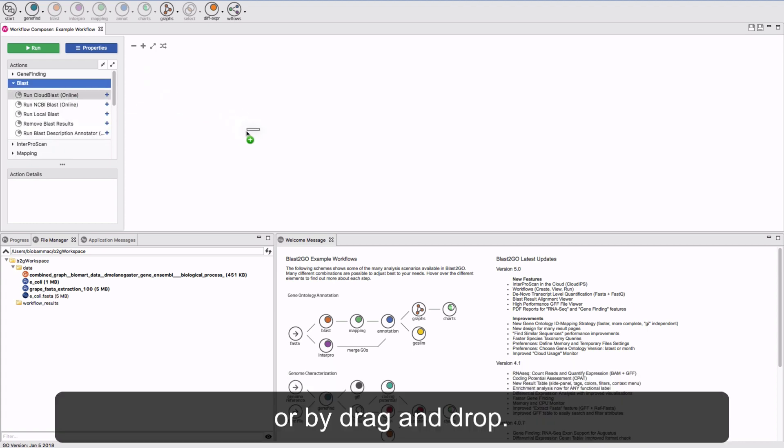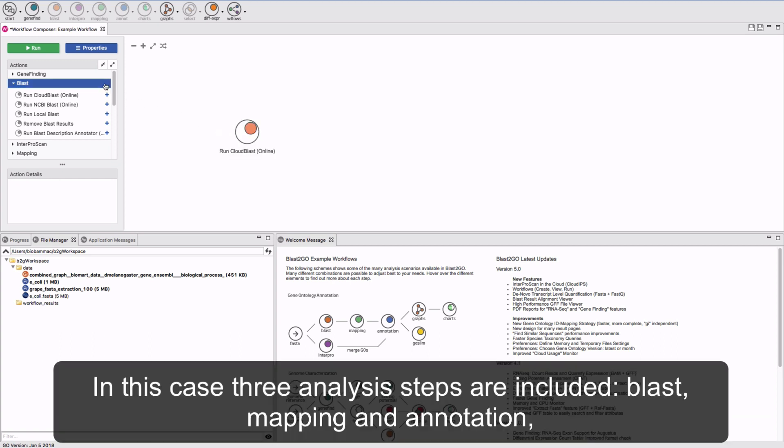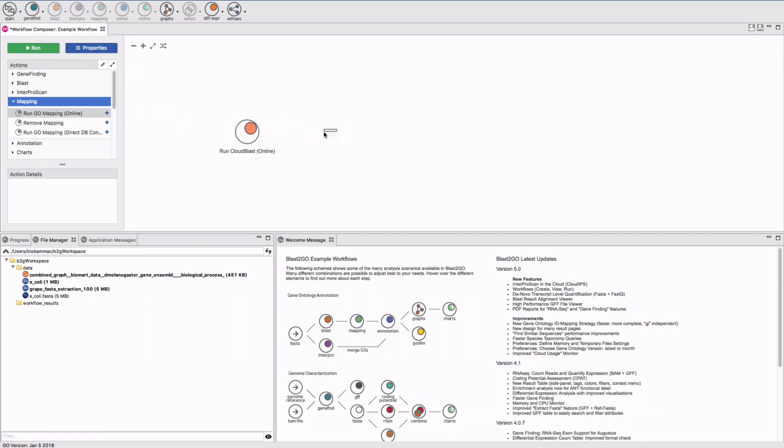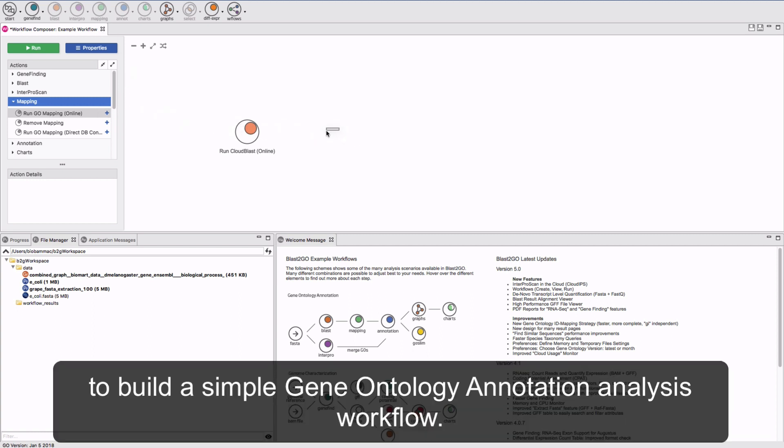You can also drag and drop. In this case, three analysis steps are included: Blast, Mapping, and Annotation, to build a simple gene ontology analysis workflow.